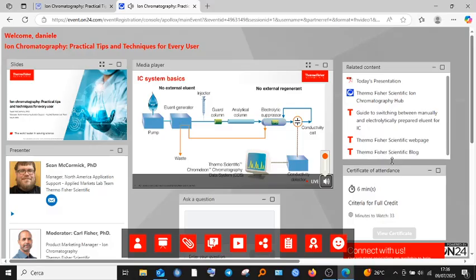And there are many different detectors that can be used for ion chromatography. In this example, we are using a conductivity detector, and that starts with a conductivity cell, where your sample is passed through, the flow continues right through it, and then we're measuring the conductivity as a function of time. If a peak comes out, either positive or negative, that could be an indication of an analyte being separated on the column. This detector, like any other detector, is connected to our data processing system.